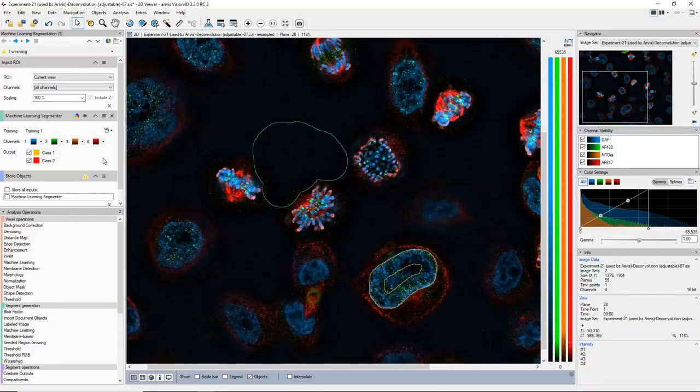So that was my segment on some of the new features in the 3.2 version. As I said, we're dying to have it out there. I've been playing with this version now with various betas for the last couple of months, and it is just, even in my opinion, quite a lot better.